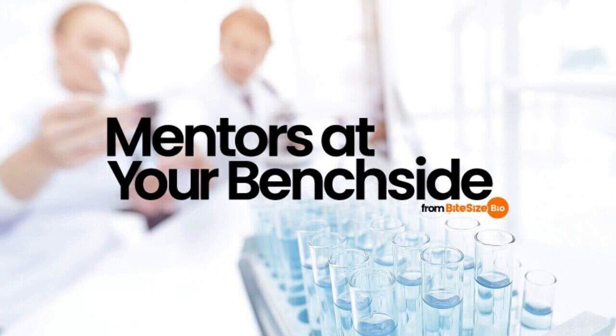As for how it works, I'll start with a brief explanation and then move on to a more thorough one. A confocal laser scanning microscope works by passing a laser beam through a light source aperture, which is then focused by an objective lens into a small area on the surface of a sample. An image is built up pixel by pixel by collecting the emitted photons from the fluorophores in the sample. Now for the more thorough explanation. I'll give this in 3 parts.